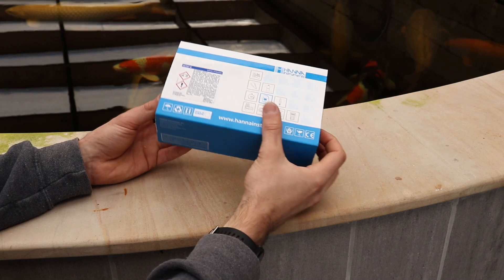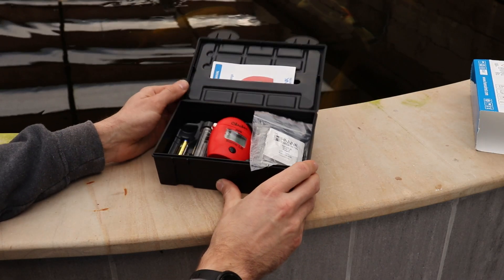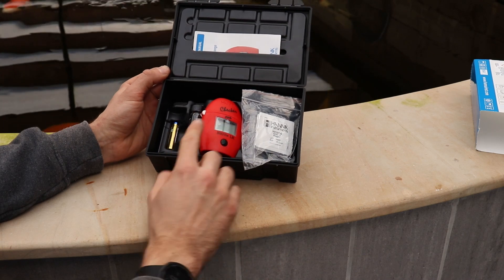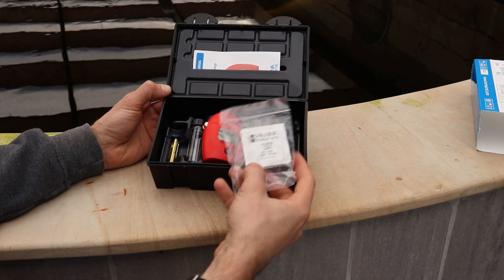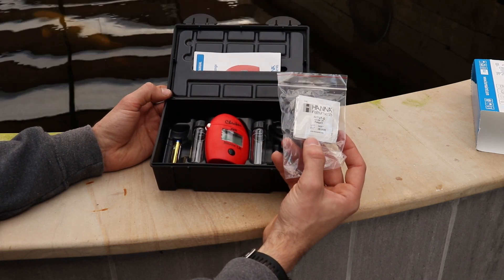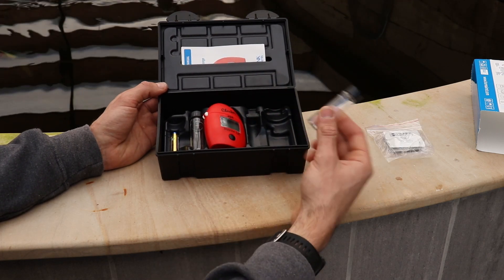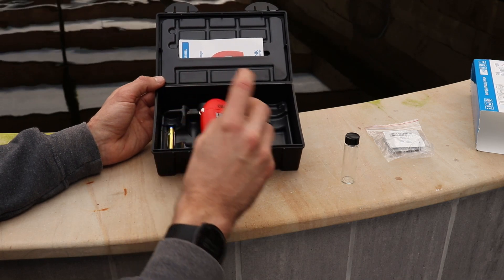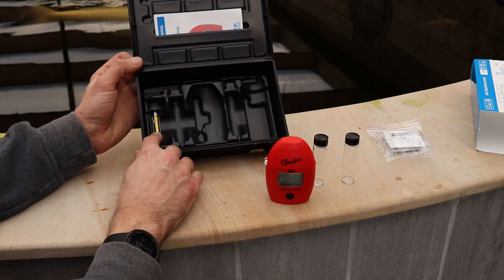Let's take a look and see what comes inside the box. First of all it comes in a really useful plastic hard case. When you're dealing with things like glass and loose reagents, it's really useful to have that to store them inside. It comes with six reagents which means you've got enough to do six tests right out of the box. You can buy refills which are either 20 or 25 per pack. It comes with two glass cuvettes used when taking the reading through the pocket checker, and also really usefully comes with the battery as well.